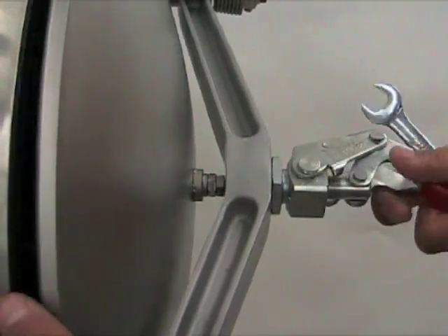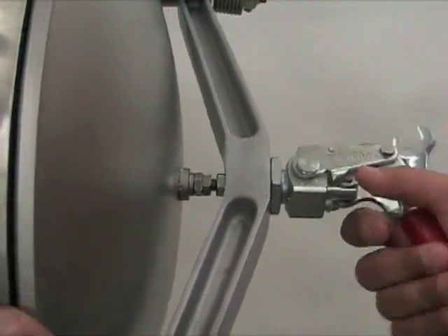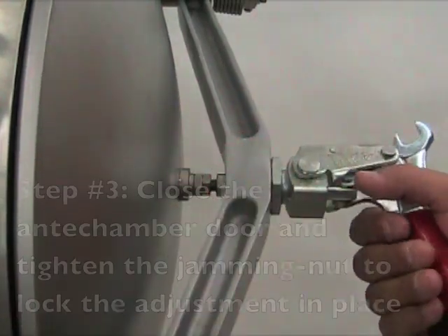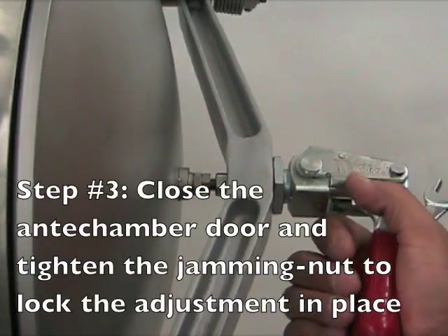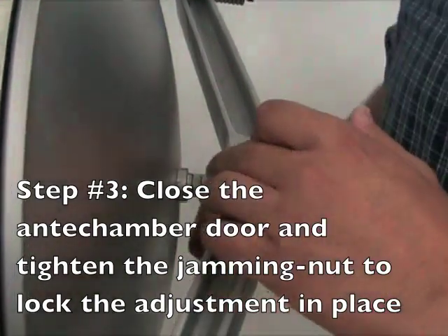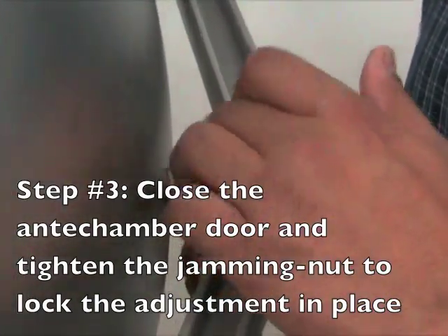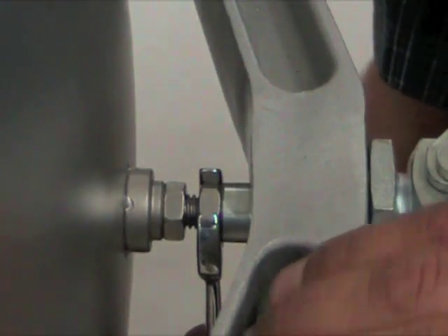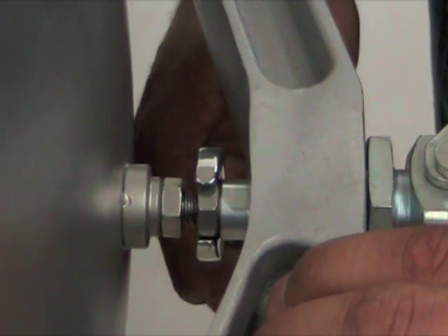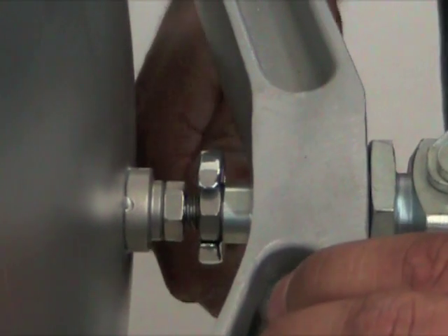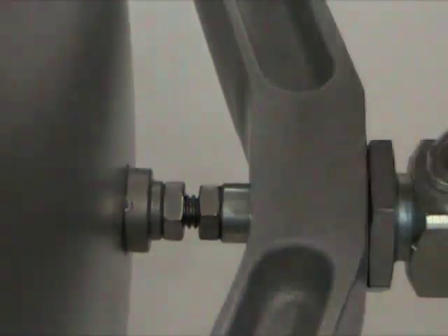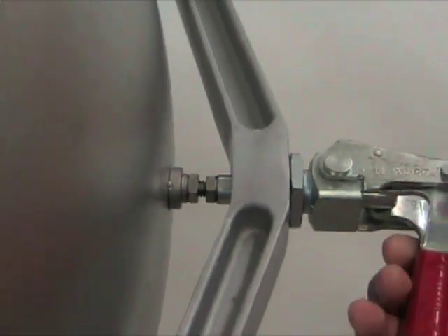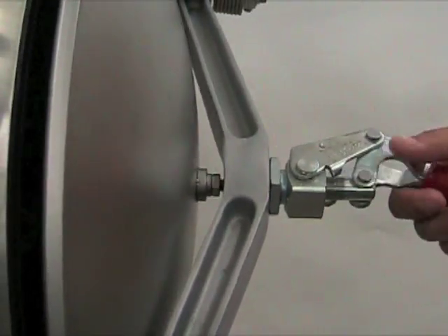So once you've made your adjustment, close the anti-chamber door and secure that adjustment by re-tightening the jamming nut with your 9-16 inch wrench. Turn this counter clockwise to secure the adjustment. And once that's been tightened, your anti-chamber door adjustment has been made.